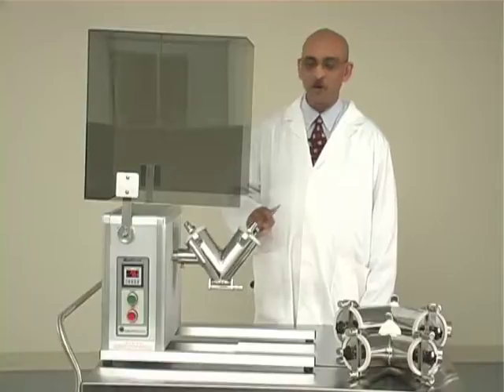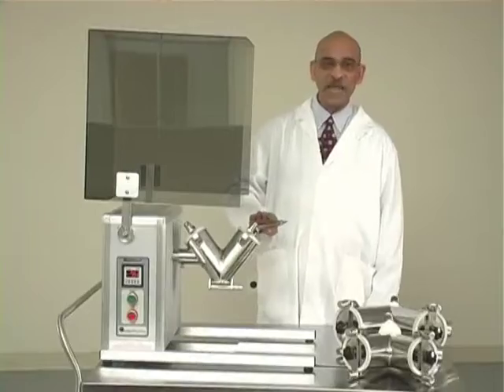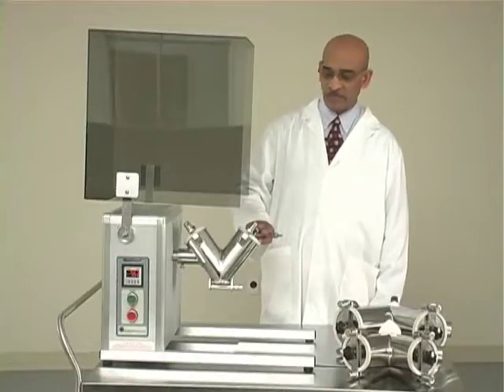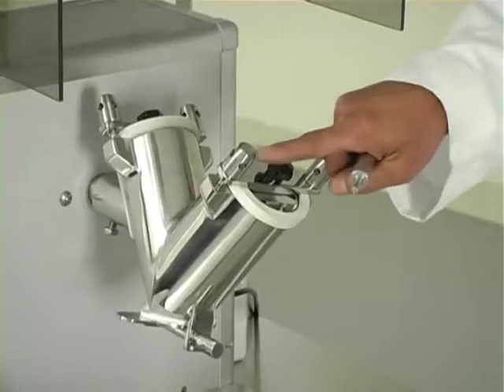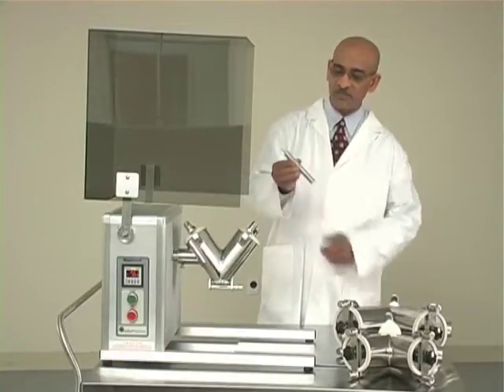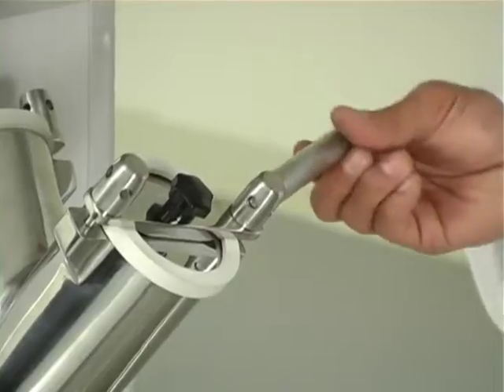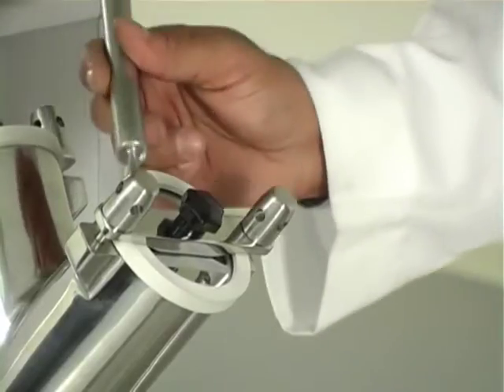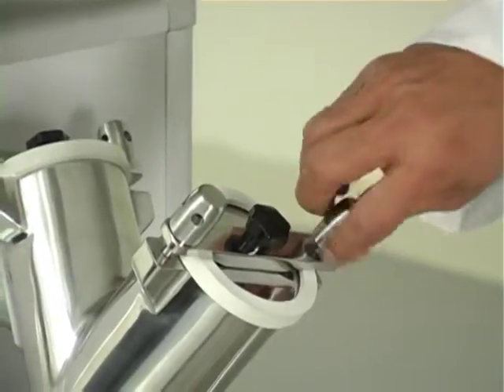Let me show you how to charge the powder in the V-shell. In order to do that, we have to open one of the two cover plates of the V-shell. Each cover plate is locked in place on the shell by means of two thumb nuts. Each thumb nut can be loosened using this tool — the pin on one end of the tool goes into the four holes on each thumb nut and you can just turn it to open them. Once they are loose enough, you can use your hand to remove the thumb nuts.